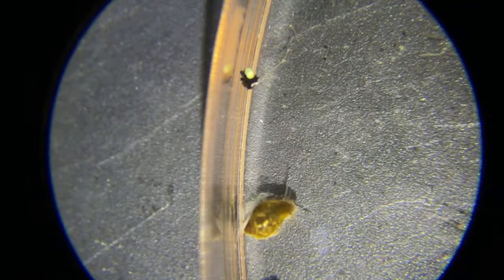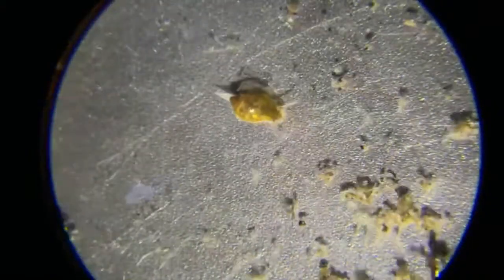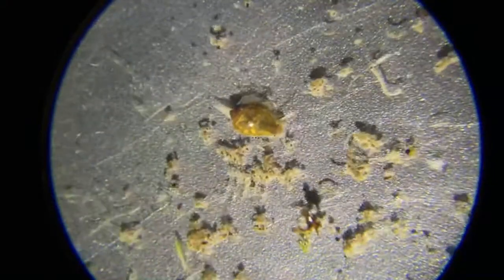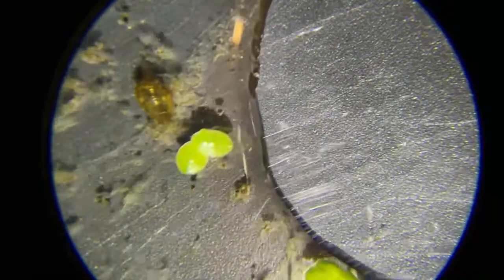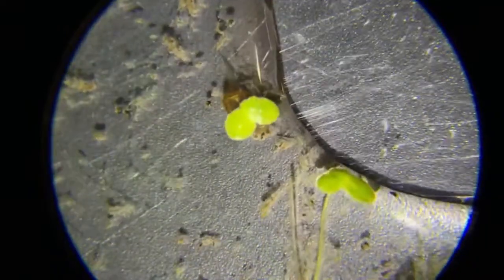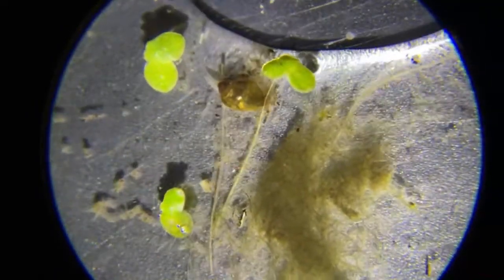So you can see those little white things swimming around. That's paramecium. They're microscopic. I don't know how old this is. I just found him a couple of hours ago when I was looking for a water bear and a hydra. And I spent about 2 hours looking for those, and I couldn't find any. And came across him. He's coming to the edge of that dry spot. That's a dry spot on my slide. That's duckweed right there. It grows in ponds. Here he comes. He's going to come over to this clump of algae.